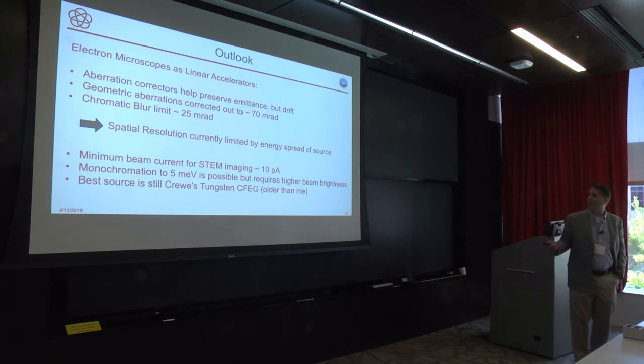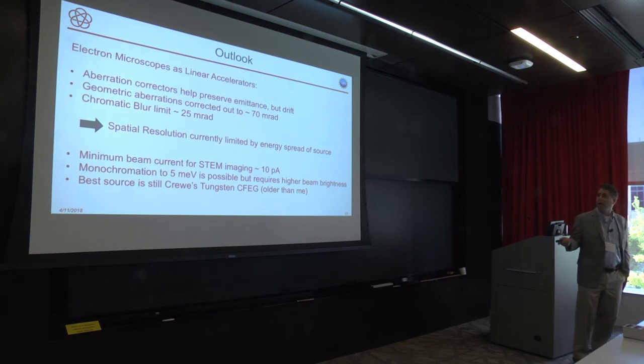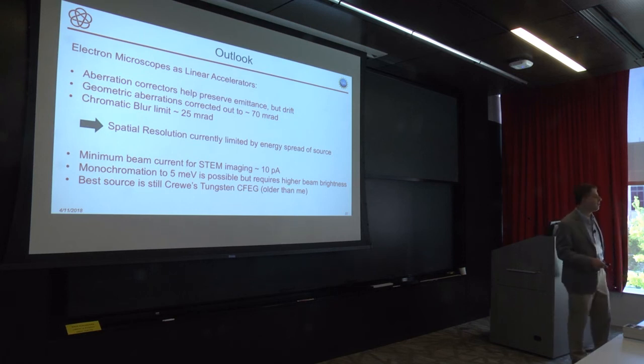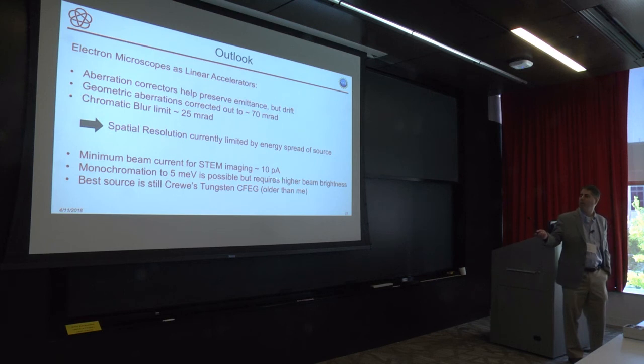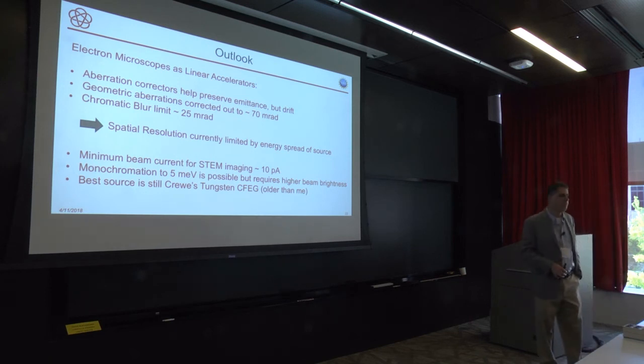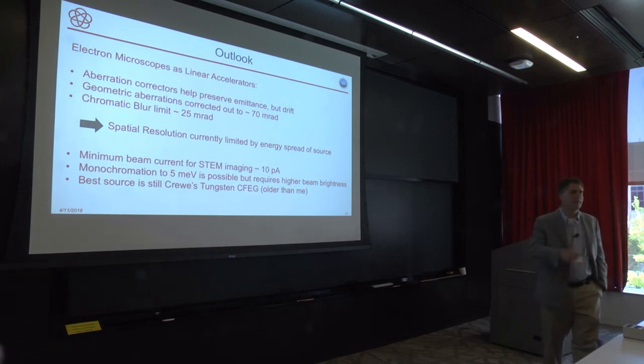Yes. So here's a challenge for us: this 50-year-old technology is still our highest brightness source today, and it's crazy to think we haven't found better materials. So for the cathode folks, that's a challenge I leave out there. And if you're a photocathode person, you can have fun figuring out how many single electron pulses I need to meet a current of about that much. So I think I'm going to wrap up and take a couple of questions.